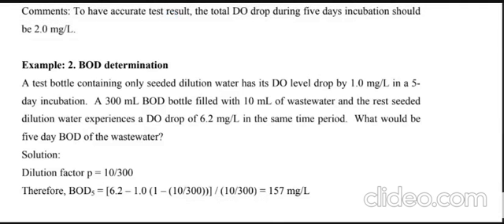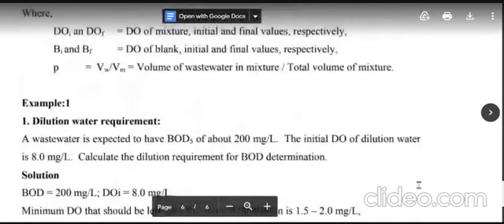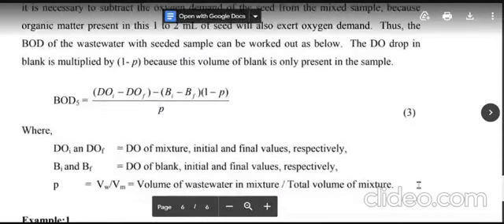Okay, now this second numerical is based on the BOD seed drop formula. Have you captured this one? Done, sir. Okay, and you use this formula to calculate.